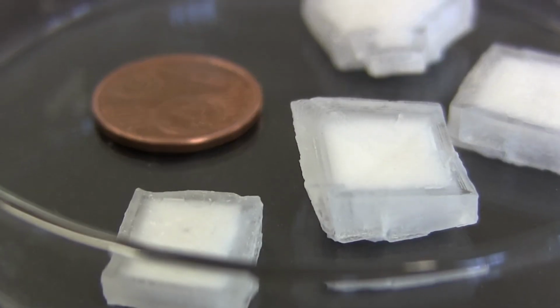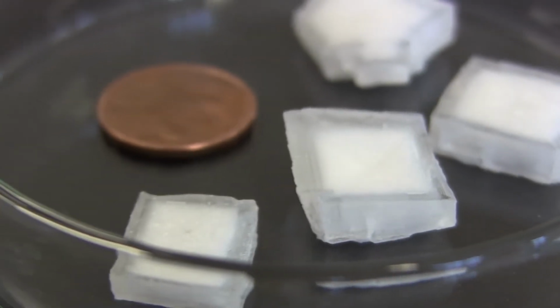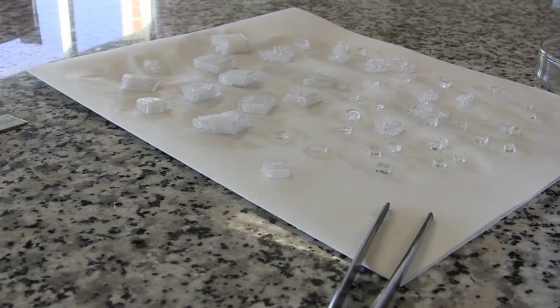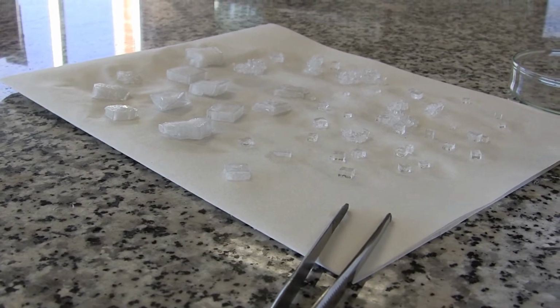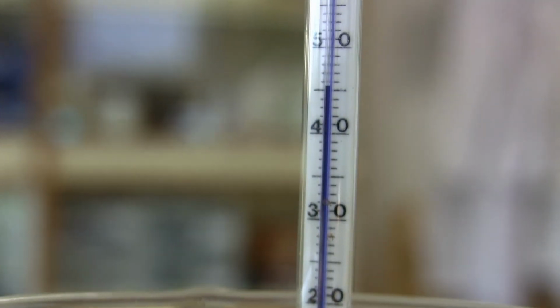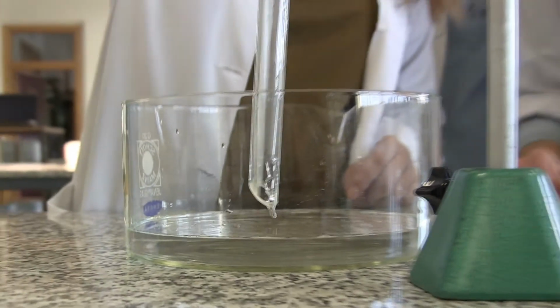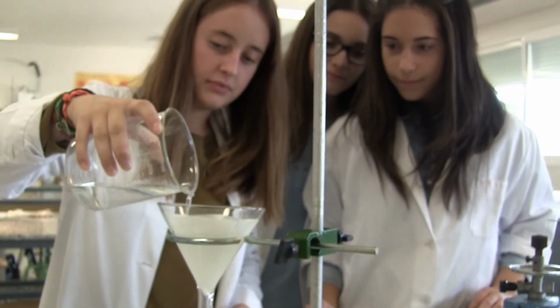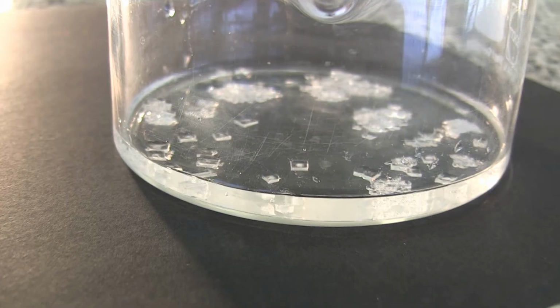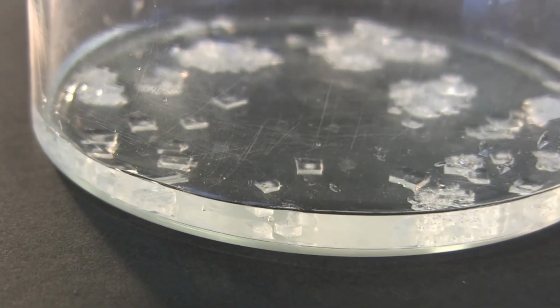Now we want to get the cubic crystals to be as large as possible. It's necessary to make the ions join together so that the crystal gradually grows. In order to get good cubic salt crystals, we must be careful with the crystallization conditions. We shall prepare a saturated sodium chloride solution at 45 degrees centigrade. We filter it onto a crystallizing dish and leave it stand in an isolated place. As the temperature slowly decreases, the solution gets oversaturated and we can see cubic crystals growing up at the bottom.